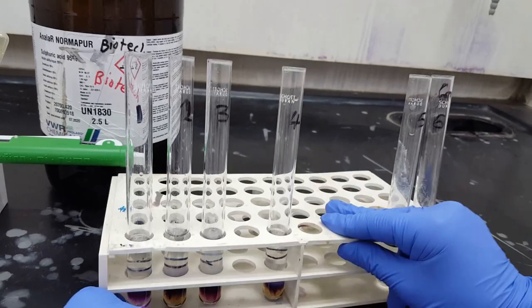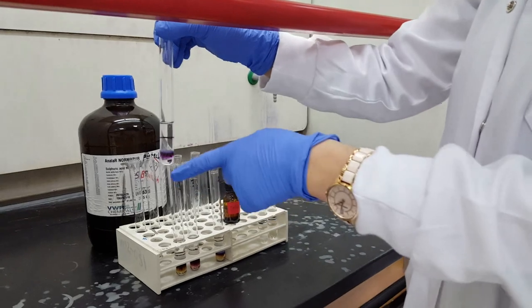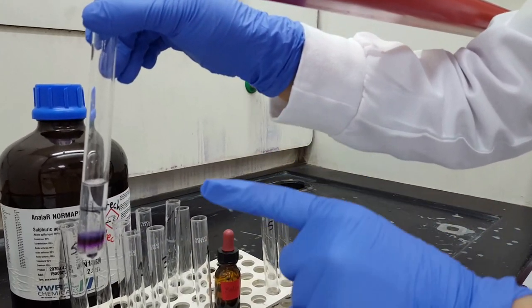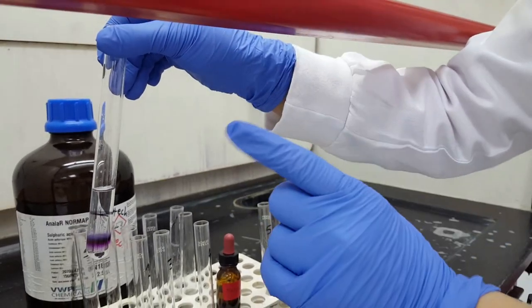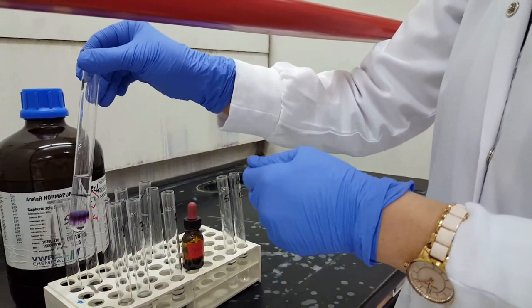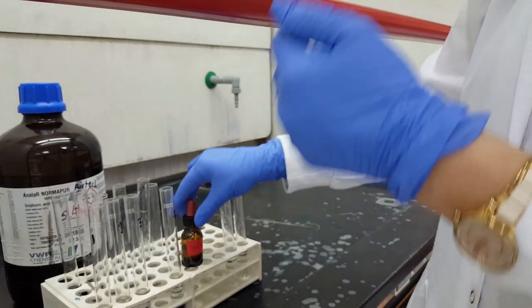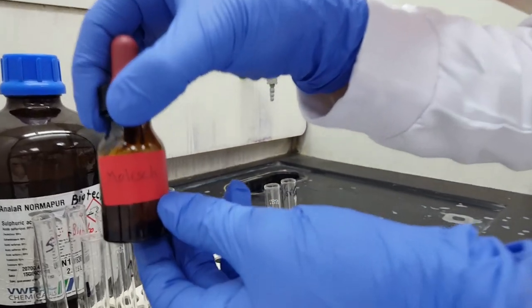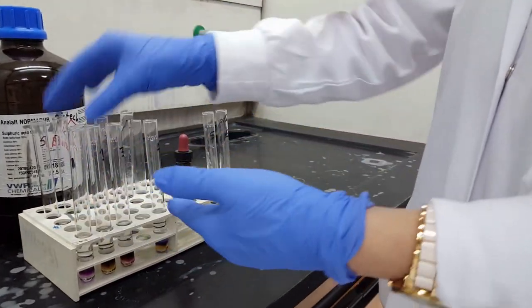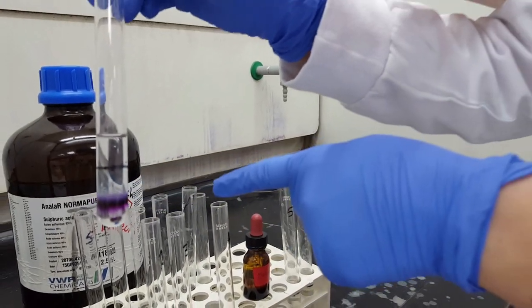So this is the principle here. What makes the interface, which forms the purple ring? At the first step, the carbohydrates get dehydrated by the sulfuric acid, so the product is going to be furfural. Now the furfural will react with the alpha naphthol, which is present in the Molish reagent. Accordingly, it will form the purple ring product. We can see it over here. This is the result of the whole reaction of the Molish test.